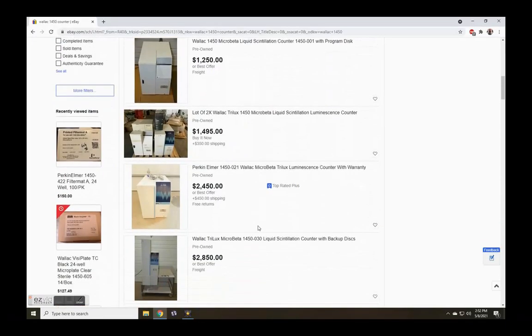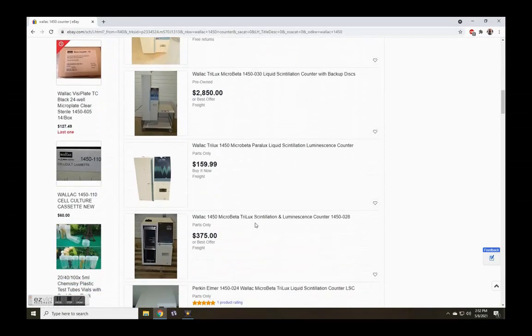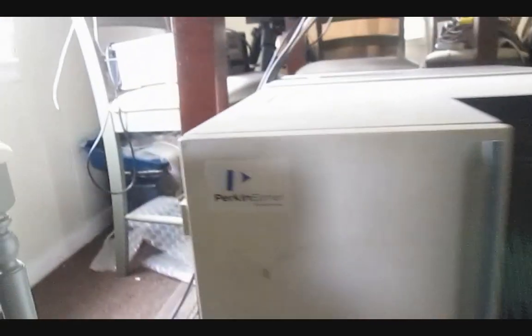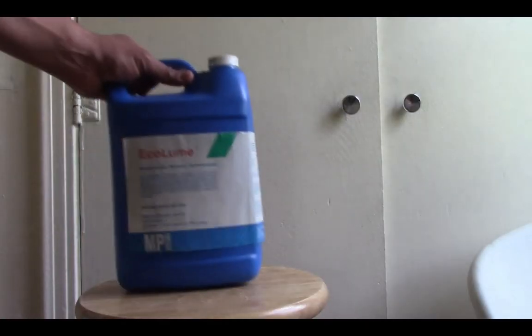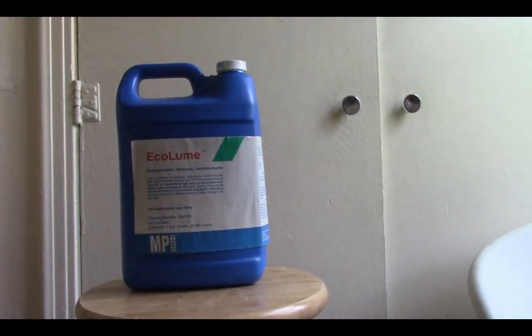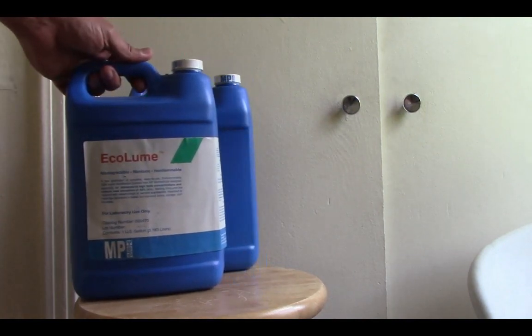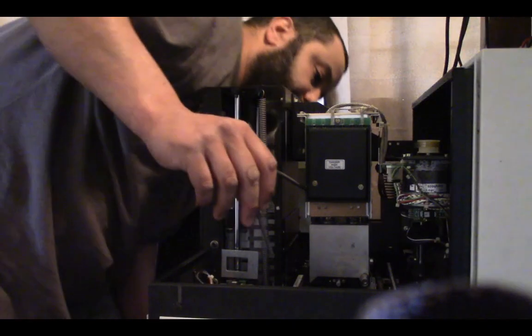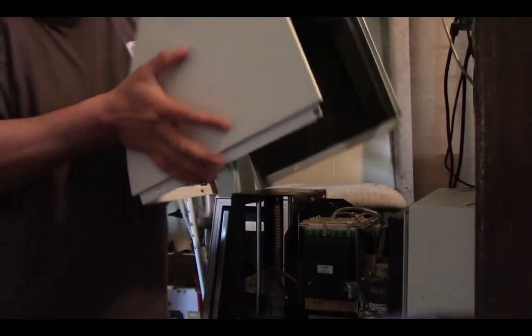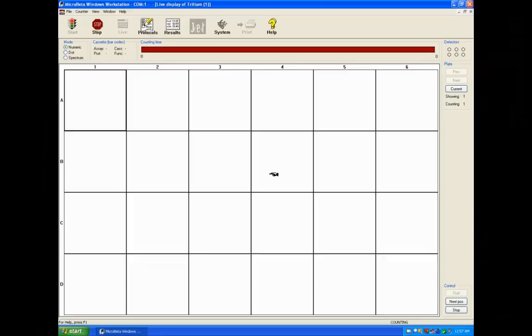So browsing eBay again, I found this liquid scintillation counter for cheap. The shipping for such a heavy lead-shielded unit was not. I was also lucky enough to find two gallons of this liquid scintillation chemical with high water and ionic tolerance for $75. After many hours repairing this unit, I got it to work with the software, which only functions under Windows XP.